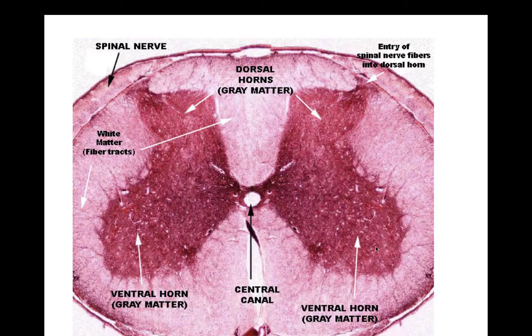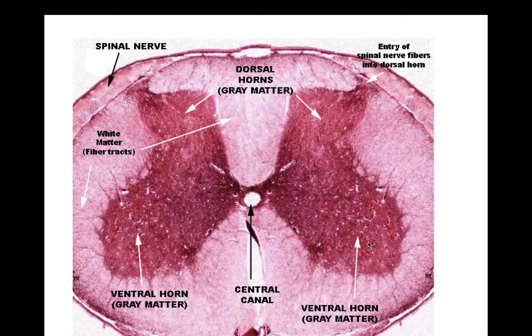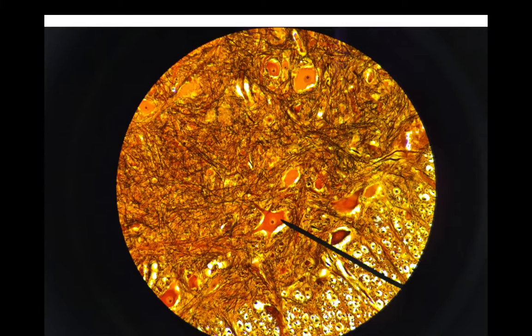The next slide is going to be showing you cells that are in the anterior or ventral horn. Remember, this is gray matter, so it is going to have lots of cell bodies — cell bodies of neurons. So what kind of neurons hang out and live in the ventral or anterior horn?